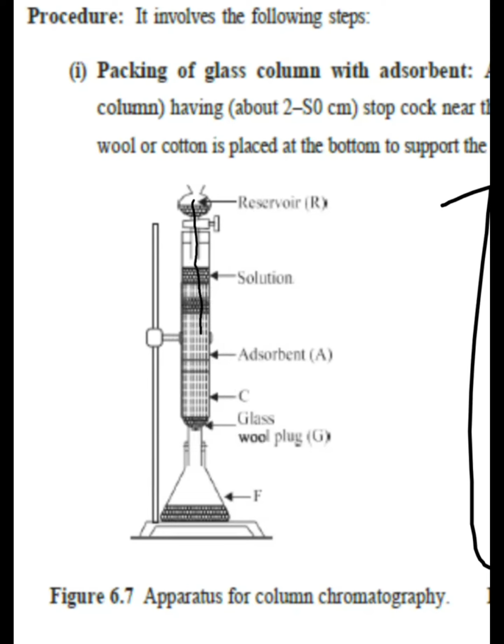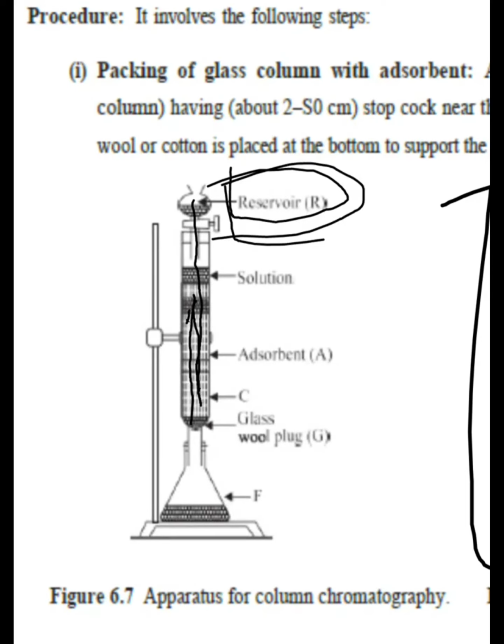The mobile phase moves through the sample and adsorbent, with different concentrations of polar and non-polar solvent, such as 1:2 or 1:3, varying the concentration of the solvents.